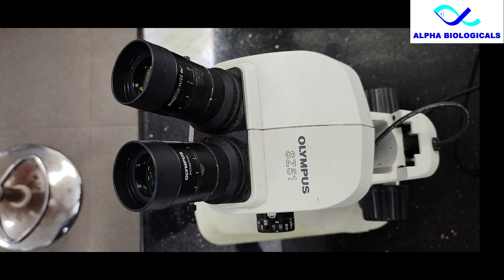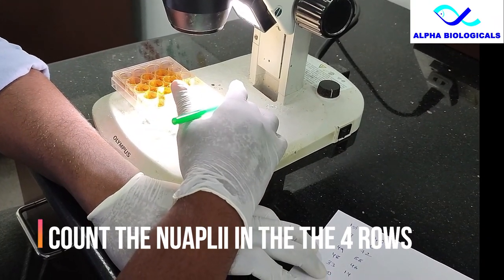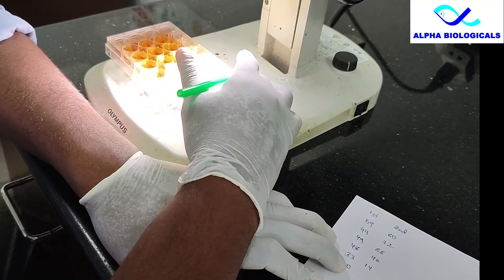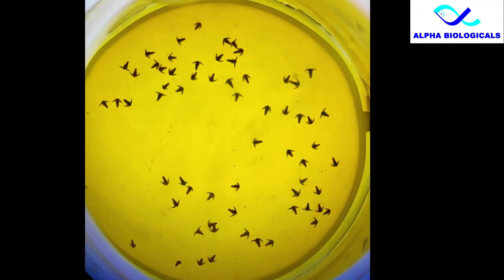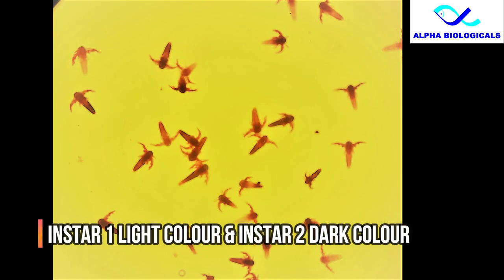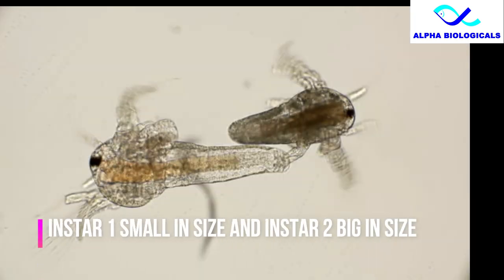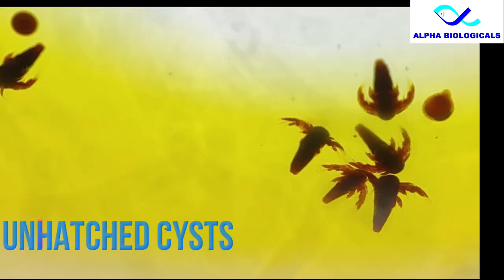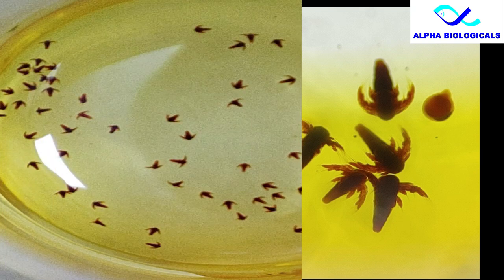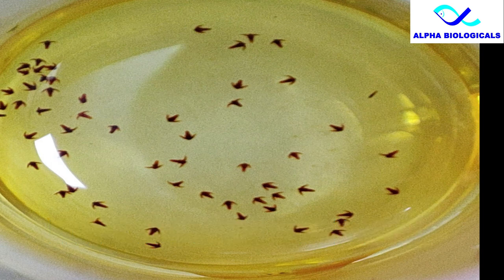Now observe under the stereo microscope and count the number of artemia present in each row. This is how artemia looks under the stereo microscope. You can easily differentiate instar 1 from instar 2 — instar 2 takes more color because of its open mouth, and is also bigger than instar 1. You can also count unhatched cysts. If you don't have a stereo microscope, you can take a picture with your mobile camera.